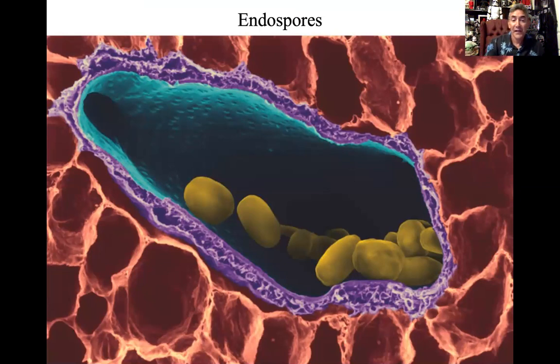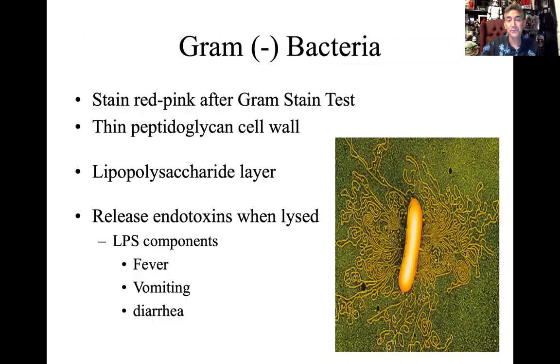How did the cell react? Well, that bacteria started to make little endospores, protecting little fragments of DNA inside of the cell. So this bacteria at this point is not dead, but it is dormant. It's just waiting for the right conditions to regerminate, basically. So that's the gram positive.